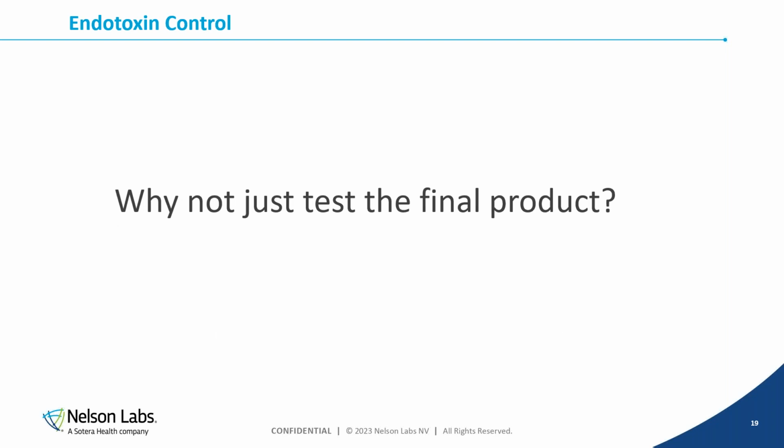So why not just test the final product? Well, if you have bioburden control, if you are performing aseptic manufacturing, the bacteria will not necessarily be present on every single device or every product.